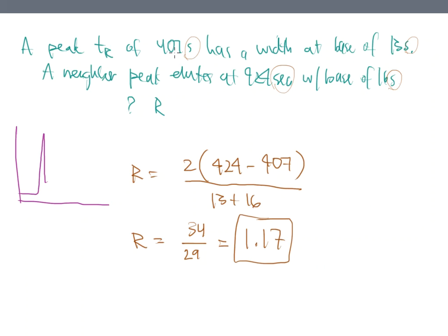So if I add 13 onto this, that's 420. So it comes down to baseline, but then it goes right back up, and then I get another peak that comes off. So the issue here is that they're close, but we need a better separation to feel better about the values in the chromatogram that I'll start reporting. So these two peaks are too close together.